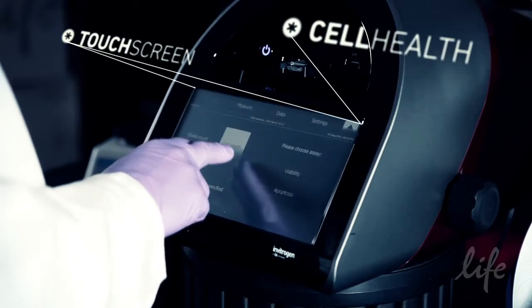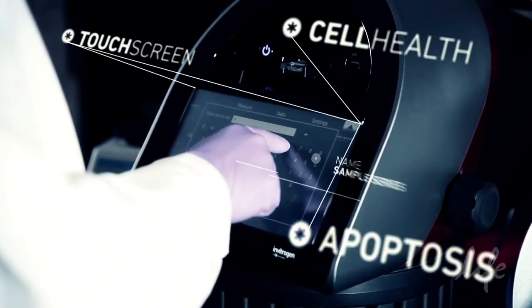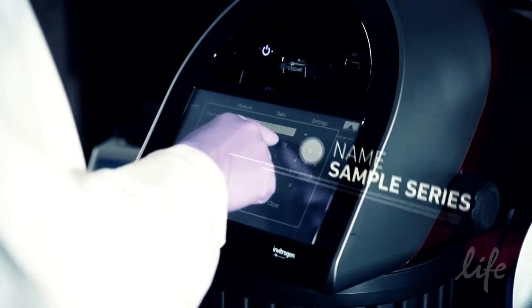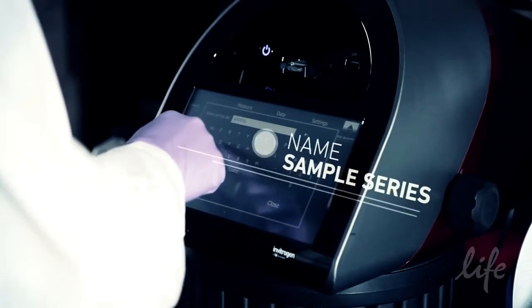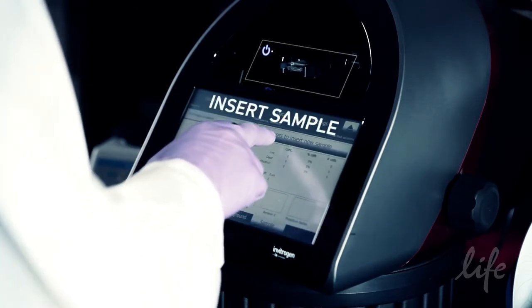Using the touch screen, touch Cell Health and then Apoptosis. Follow the prompts to name your sample series. You can name the samples now or you'll have opportunities later. Now touch the Press to Insert Sample button on the screen.